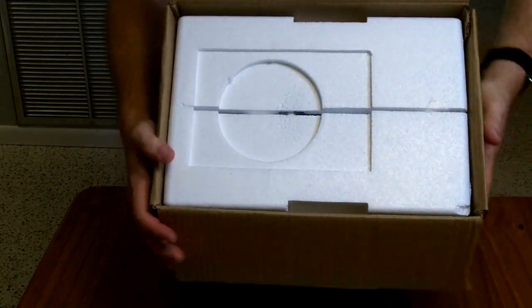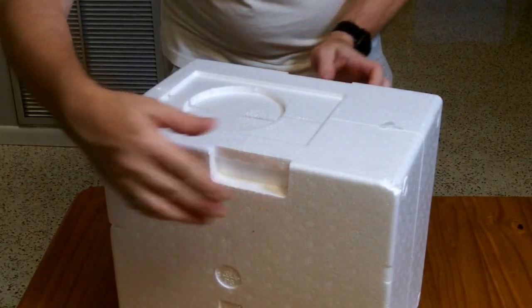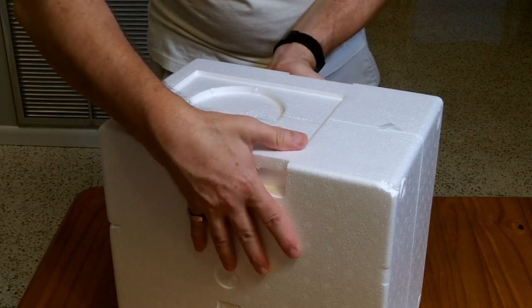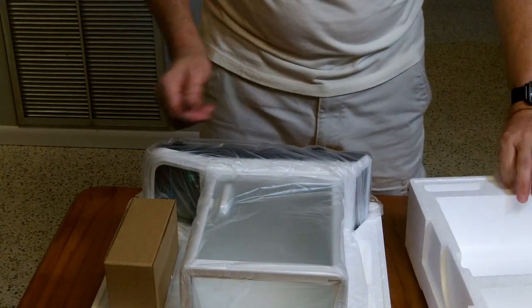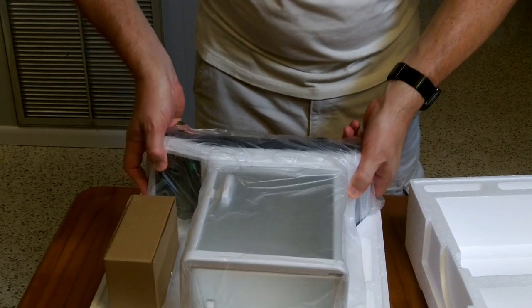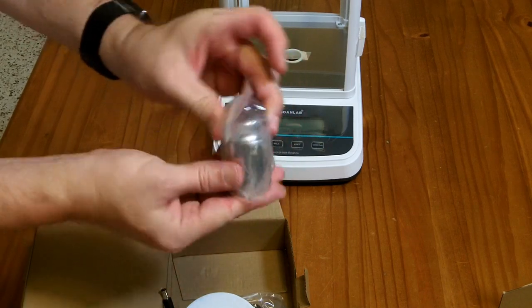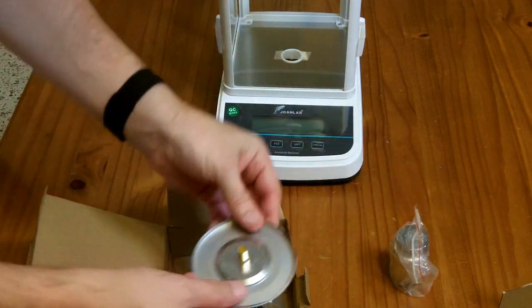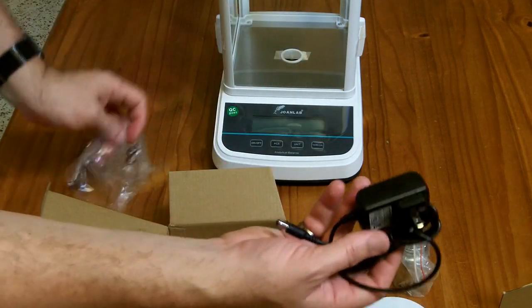On the top you get the manual. So the styrofoam is loose in the box and it has some handles on it so you can pick it up and pull it out of the box pretty easily. And I do recommend keeping the packaging material in case you ever need to move or store this. In the accessory box they include a calibration weight, the weighing table that goes in there, and an AC adapter.